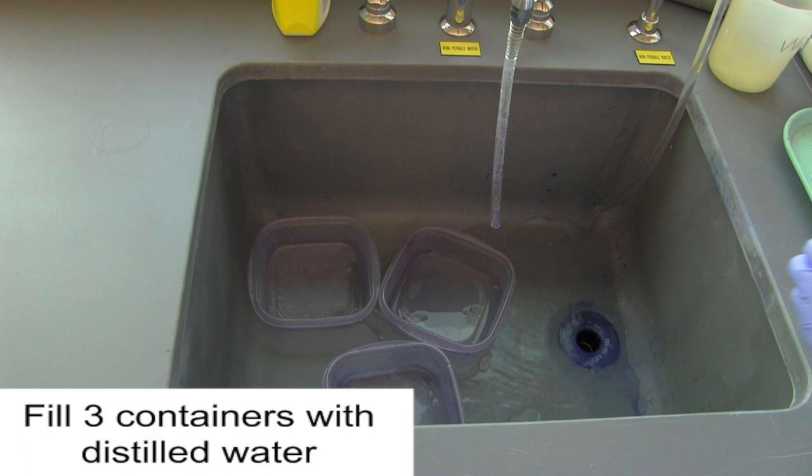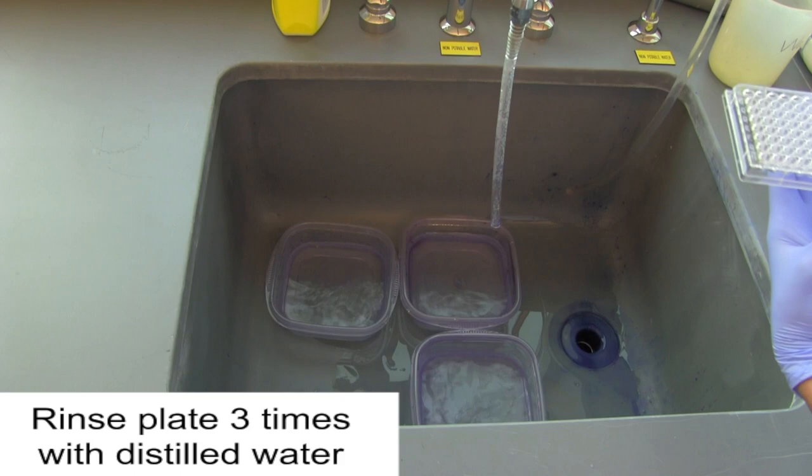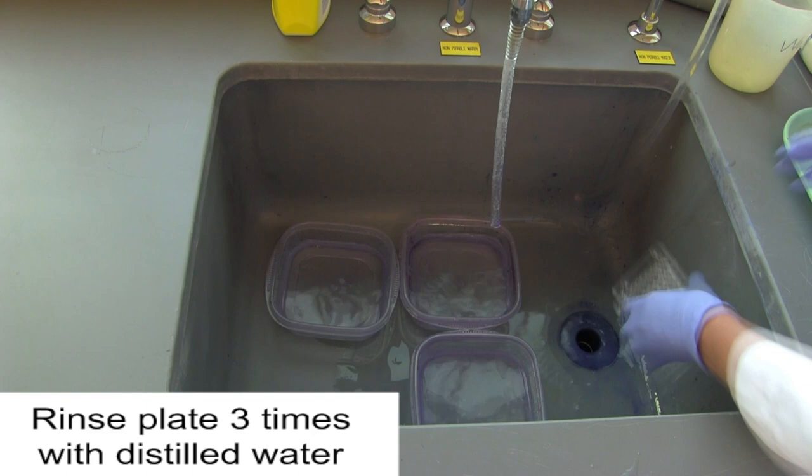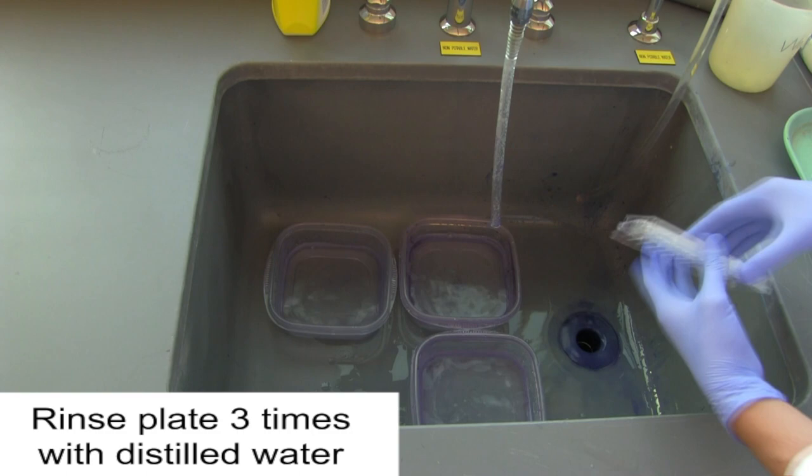Next, fill three containers with distilled water. These will be used to wash out any excess planktonic cells. Next, plunge the plate into the first container and shake the cells out into the drain. Continue with the second and third containers.